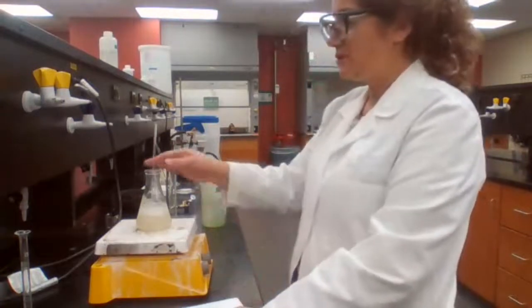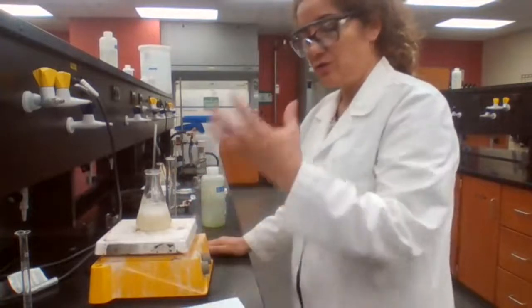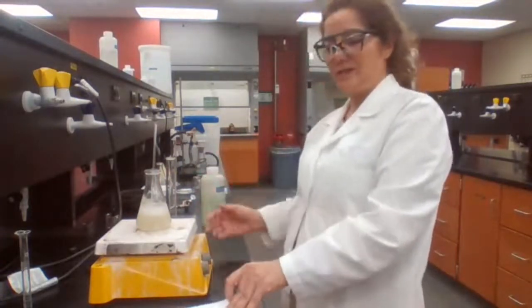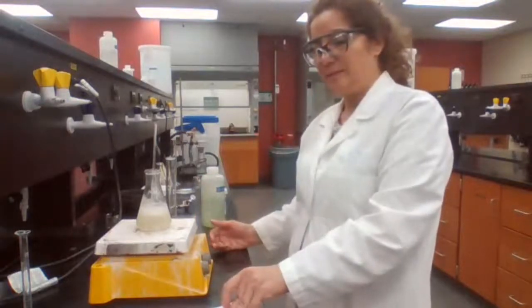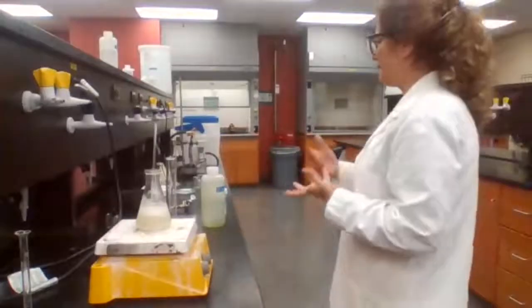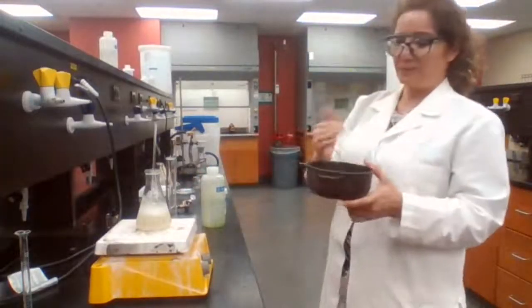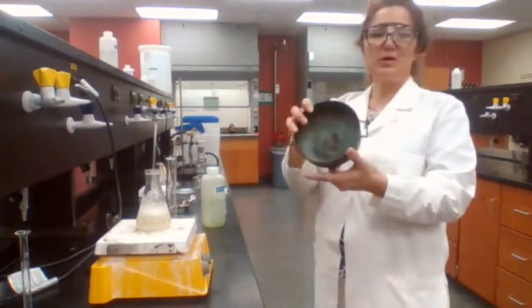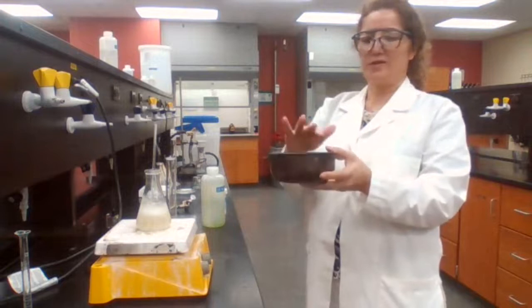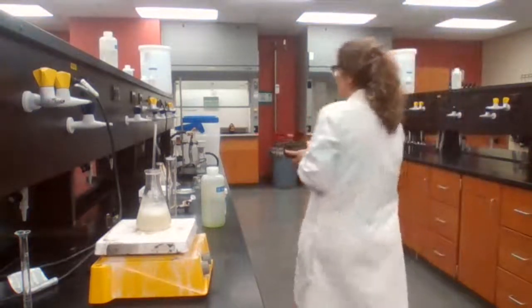When we get the clear solution, I take it right away and place it on the bench top to cool down to room temperature. When I see the crystals, then I use the ice bath. While I'm waiting for this, I can prepare my equipment for the next step, which is preparation of the ice bath. I use a copper pot for the ice bath, so I simply add ice to the copper pot.